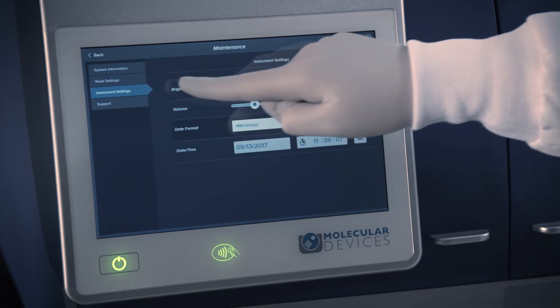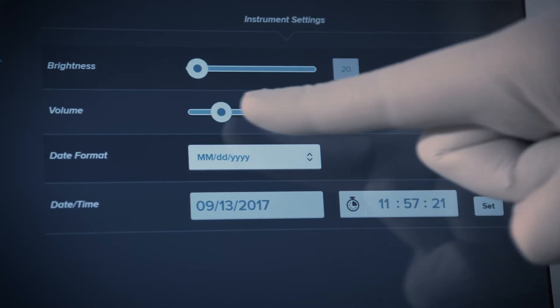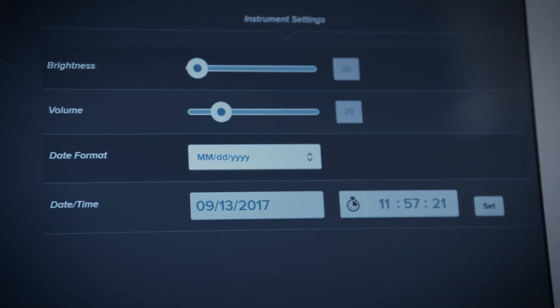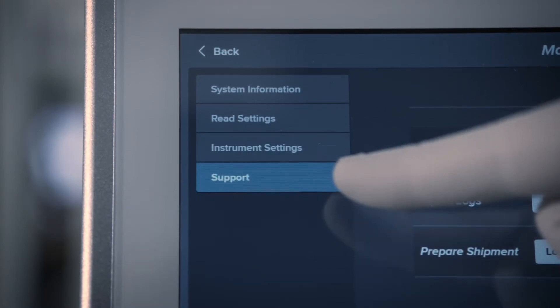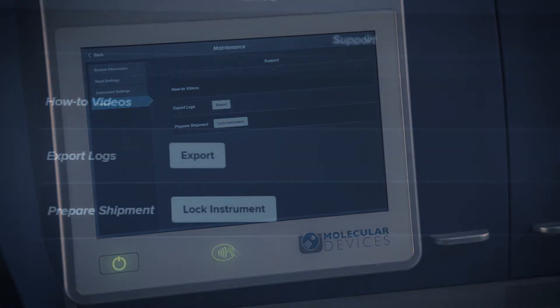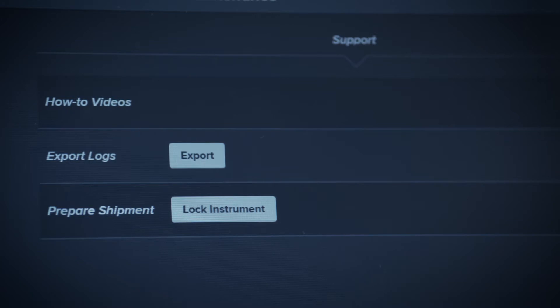In the Instrument Settings tab, you can adjust the screen brightness and volume of the instrument, or change the time and date. In the Support tab, you can view helpful how-to videos, retrieve instrument log files, or prepare your reader for shipment.